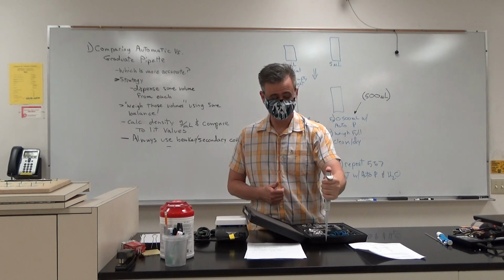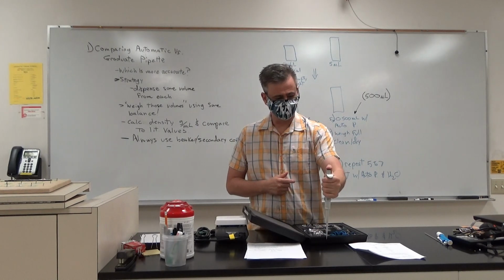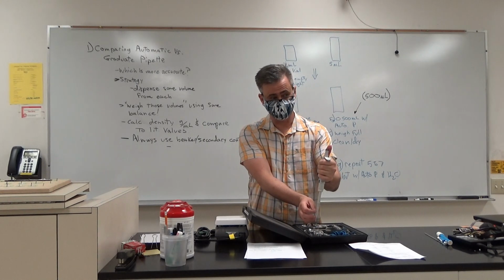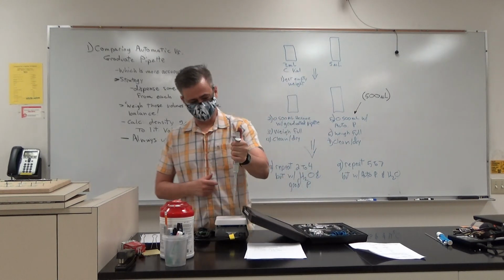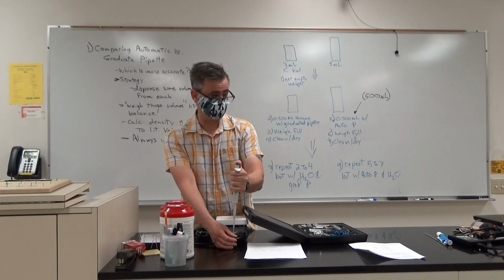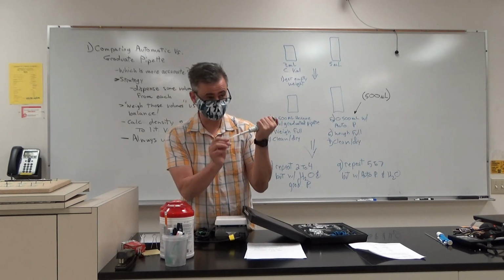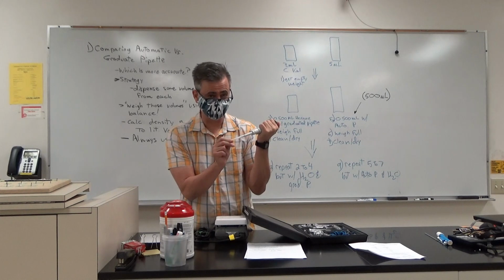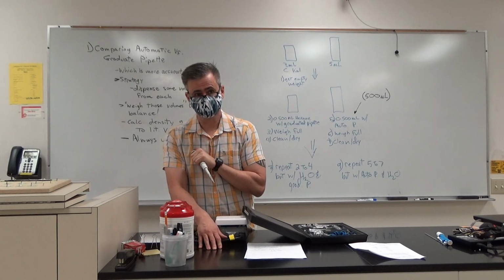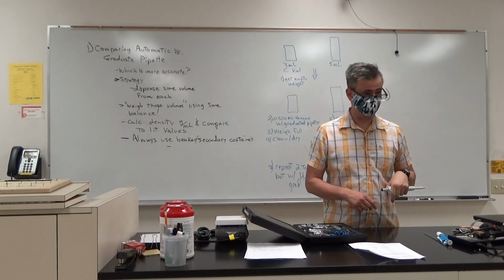Out of the liquid, I go to the first stopping point. I put it in the liquid. I don't just release it like I'm letting a cork go. I smoothly pull it up. That way I'll avoid bubbles at the tip of my pipette. Then I move it over here and squirt out into my conical vial, my hexane or my water, whatever it is. To get that last little bit that's stuck in the very end through capillary action, I'll give it that extra little squirt.